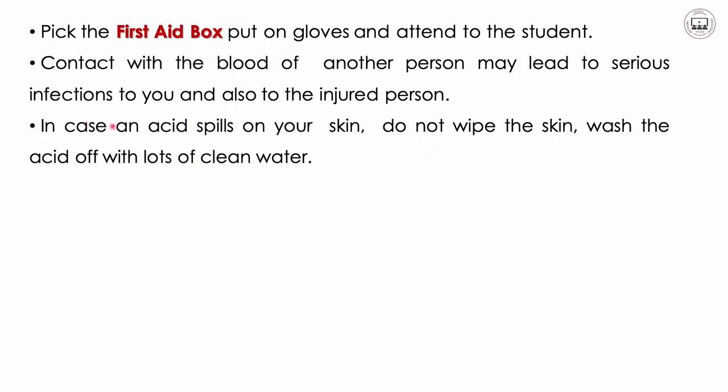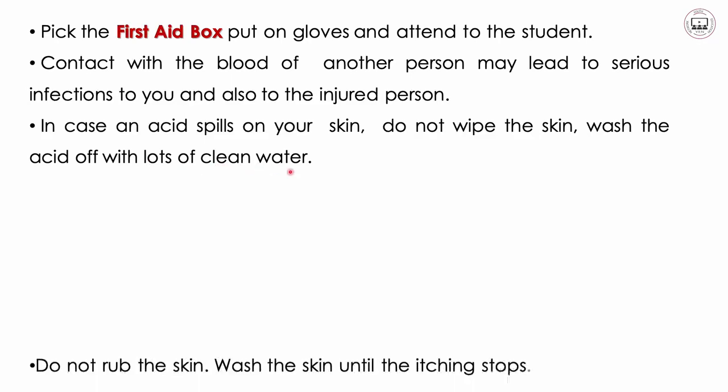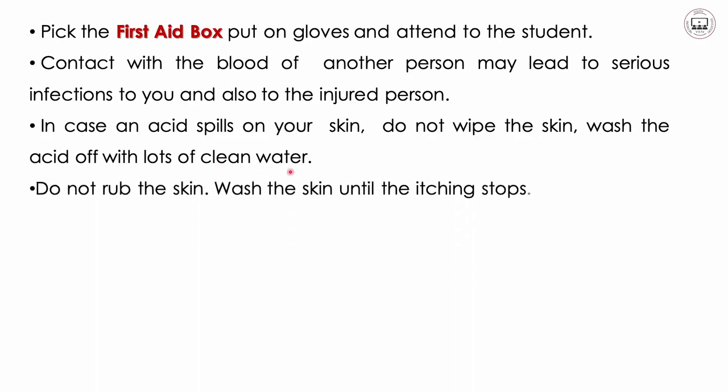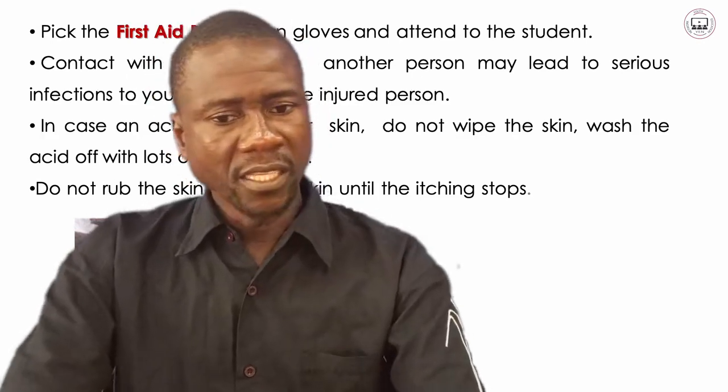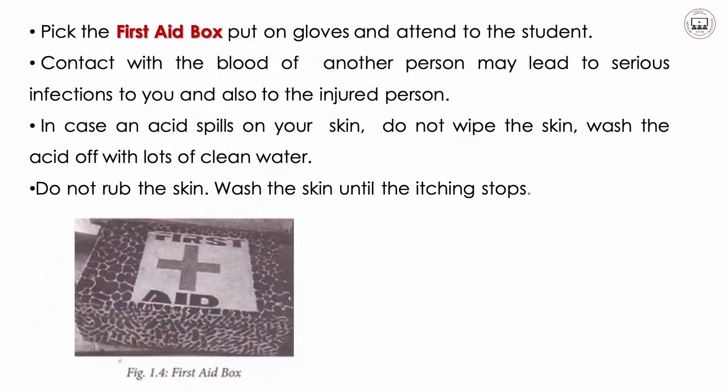So in case an acid spills on your skin, do not wipe the skin. Wash the acid off with a lot of clean water. Do not rub the skin. Wash the skin until the itching stops. So this is the first aid box which you are supposed to use when you are handling cases in the laboratory.